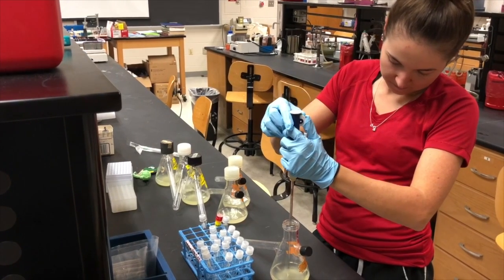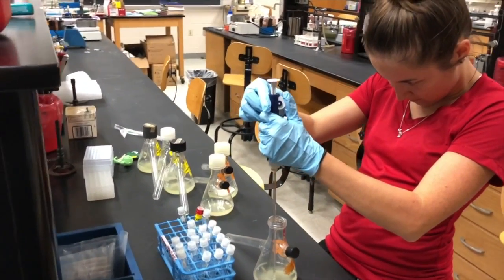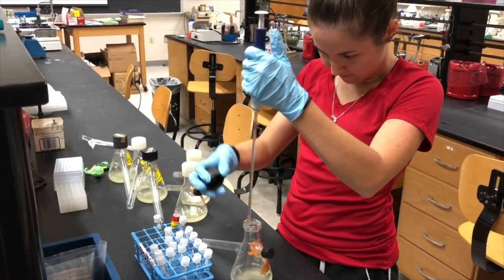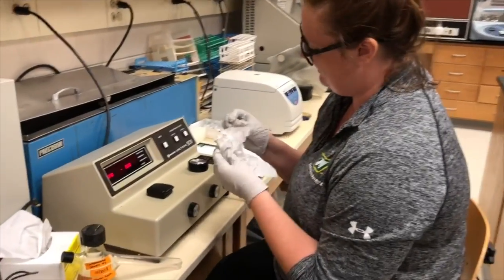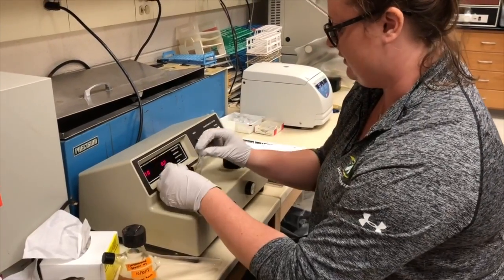In order to use the spectrophotometer, we put samples into sterilized test tubes so that they can be inserted into the machine, and that way we can continue our tests. We then measured absorbance readings of each flask twice a day, morning and evening, for a 1-week period using a spectrophotometer. We had a total of 2 trials.